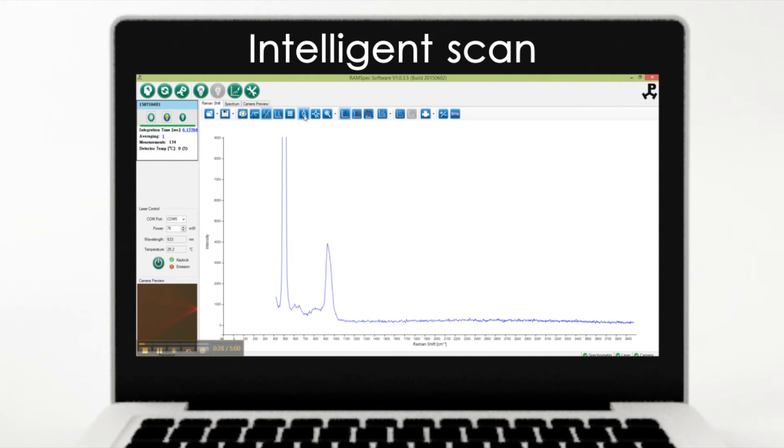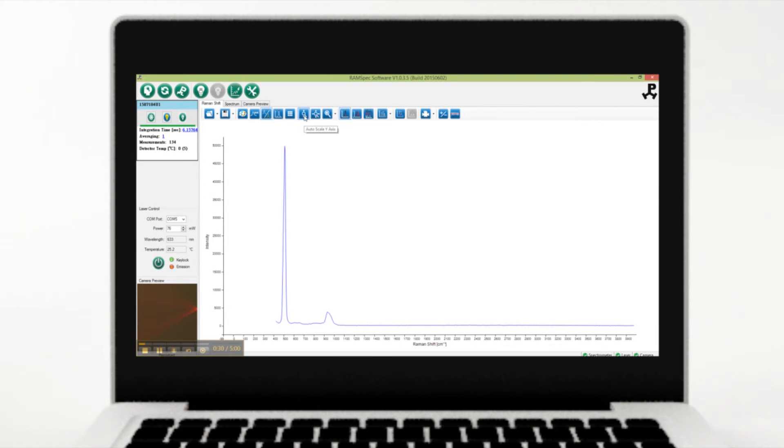The software can set the integration time to reach spectrum optimization. You just need to right-click on the spectrum image and you can immediately demarcate the peak, calculate the full width at half maximum, and also calculate the integral area to do spectrometer operations.